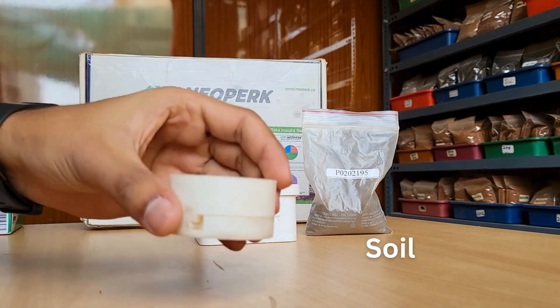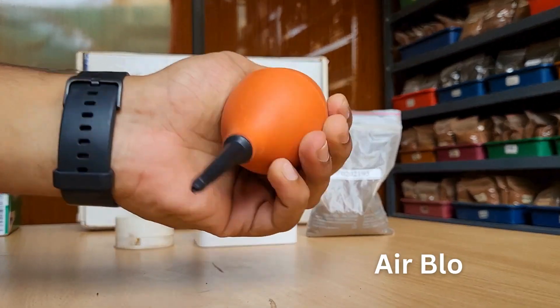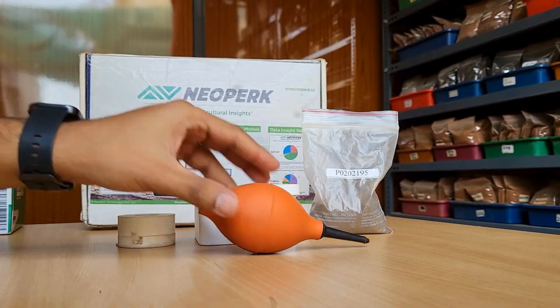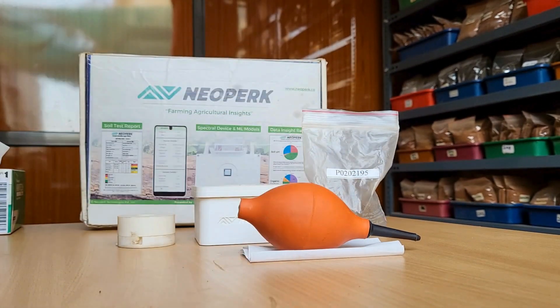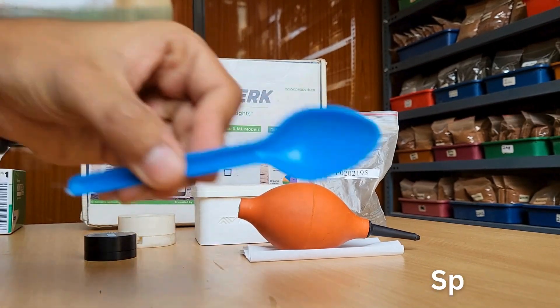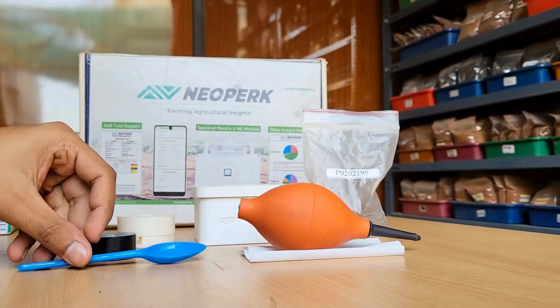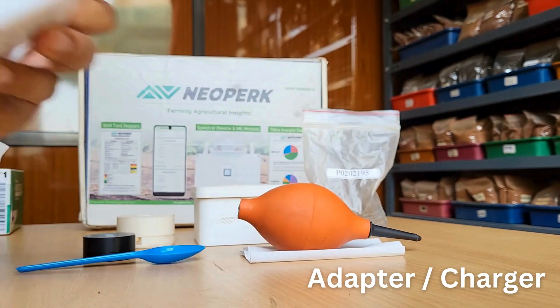We'll also require a soil sample holder, a blower, lens tissue, white reference material, a spoon, and a mobile adapter or charger for powering the device.